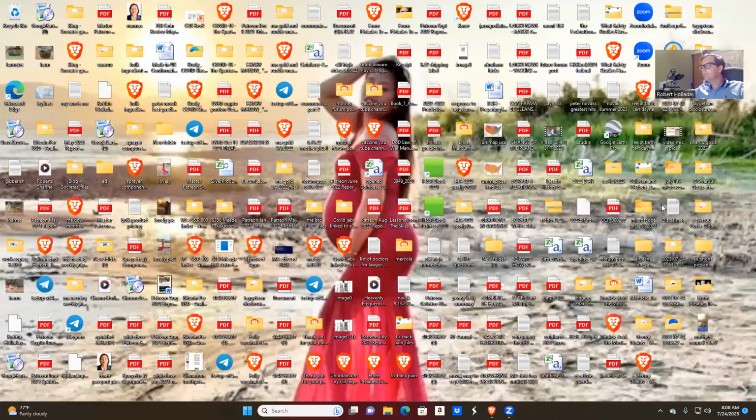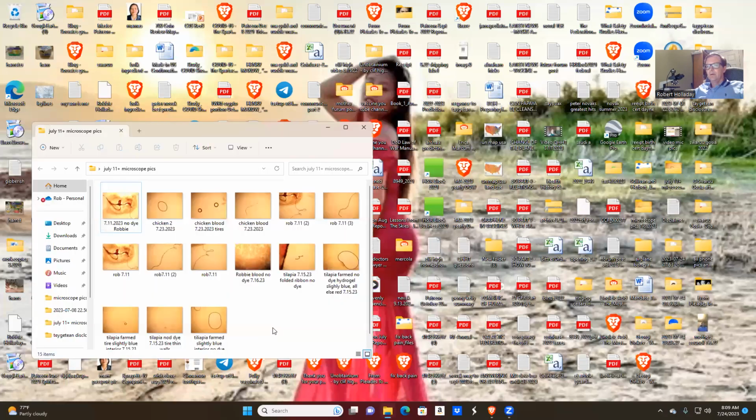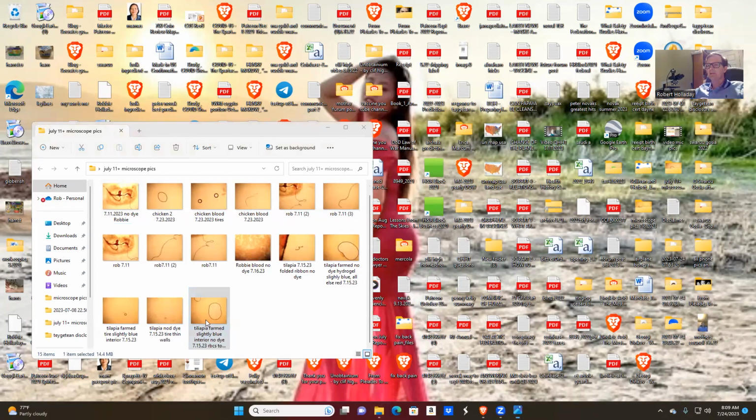Okay, so I took some pictures of slides taken from chicken blood and tilapia blood. Dr. Mahaika did pork, beef, and dairy, and she found Microtech in those. And so I chose to take a look at chicken and fish. Okay, so all pictures were taken at 200x magnification.